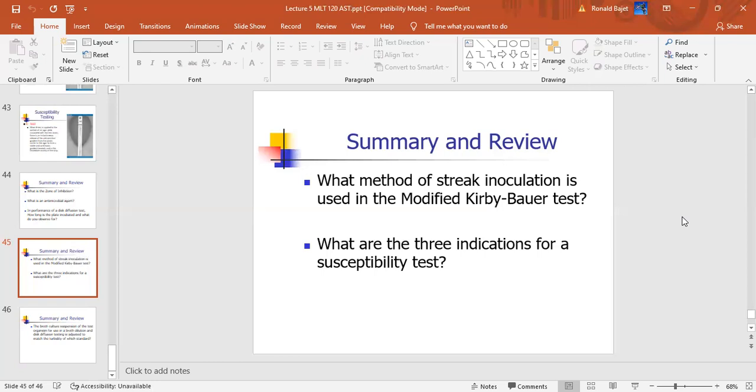So I can say it's salt broth sensitive, it's catalase positive, which it is, it's coagulase negative, it's non-beta hemolytic, but I could also say if you see bright lemon yellow, okay, there's no other organism in this semester that's bright lemon yellow.